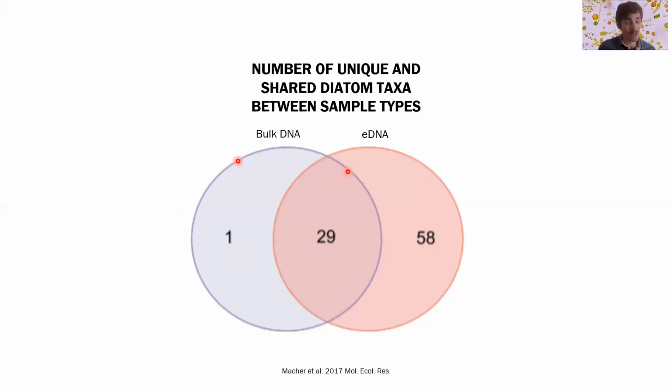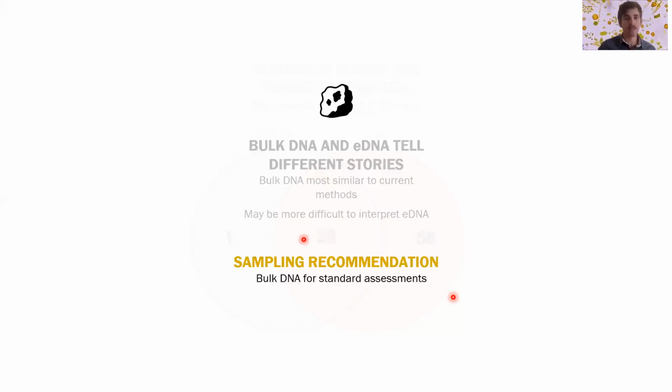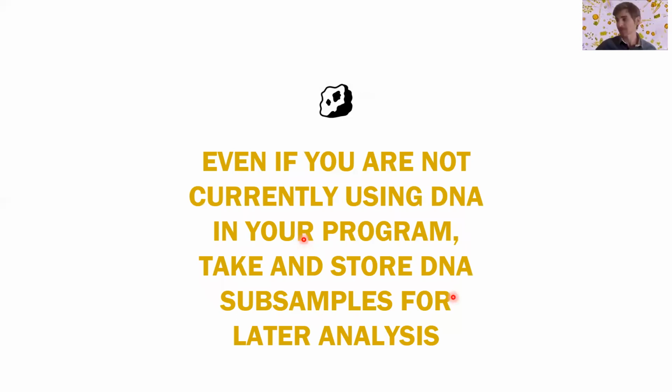A lot of work hasn't been done on actually applying eDNA to assessments in diatoms. Most of it has been on bulk DNA. The main takeaway is that bulk DNA and eDNA tell different stories. Bulk DNA is most similar to current methods, and it may be more difficult to interpret eDNA because it is integrative, because you have to consider things like hydrologic flow paths and other potential sources of that DNA. So for now, my sampling recommendation for the most immediate implementation of DNA into bioassessments is to use bulk DNA for our standard assessments.